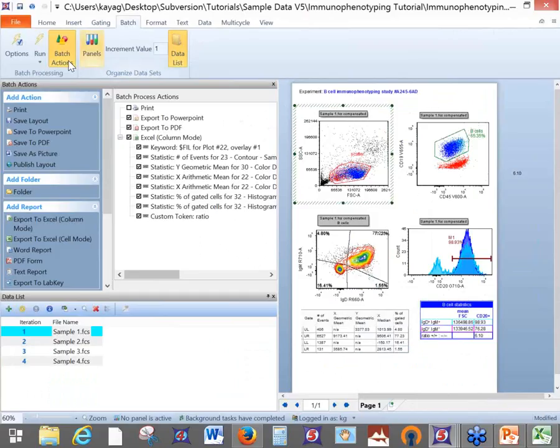And I just want to point out that in FCS Express 5, if you were to save, close, and reopen this layout, you could click rerun here rather than the run lightning bolt, and then these batch processes would be re-exported with all those gate changes that you made in FCS Express, okay? And that's a feature called Snapshots, which we do have a webinar all about. And if you have any questions about that, feel free to type that in. We can definitely point you to the resources you would need to use that feature as well, okay?